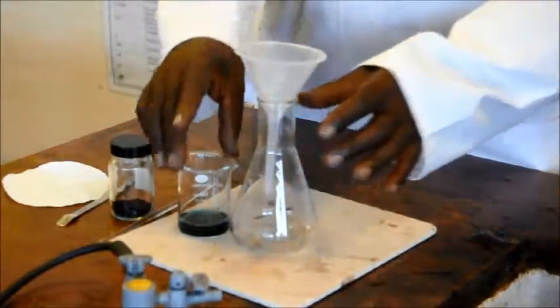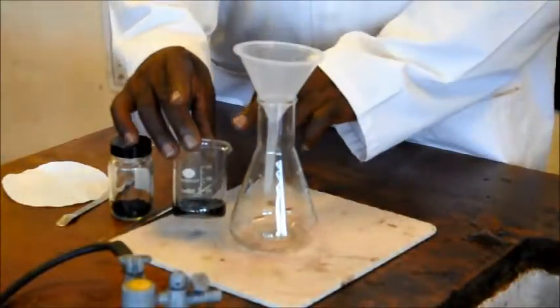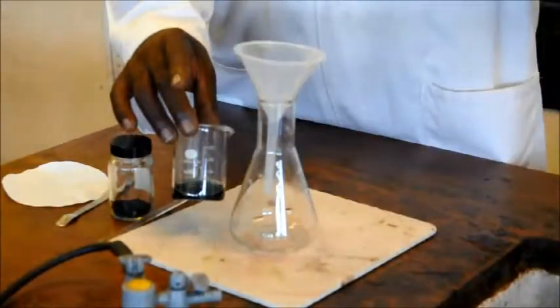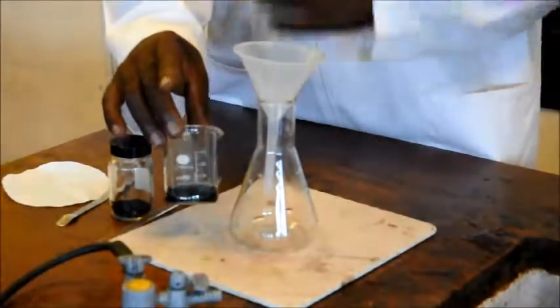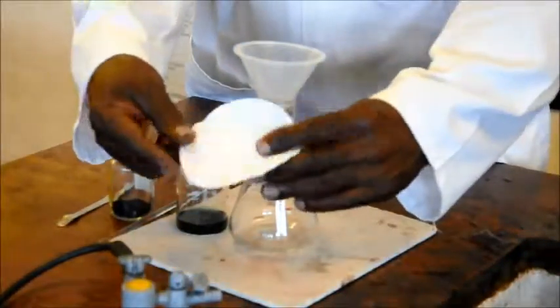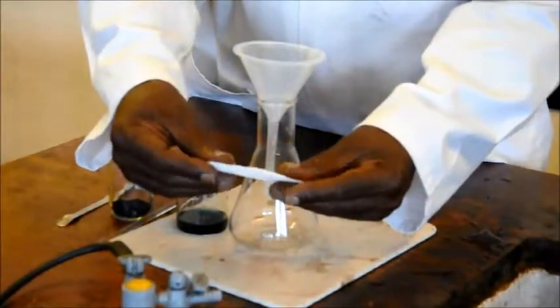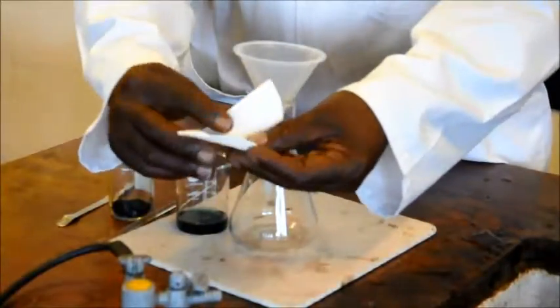Okay, the next stage is to separate the unreacted copper oxide from the copper sulfate solution. The copper oxide is the black solid and the blue solution is copper sulfate. Now because the solid is insoluble, I'll filter it. My technique is to fold the filter paper in half and then in half again.